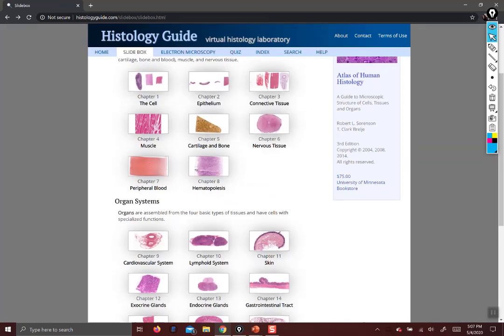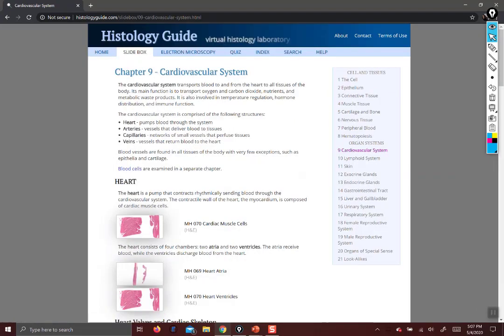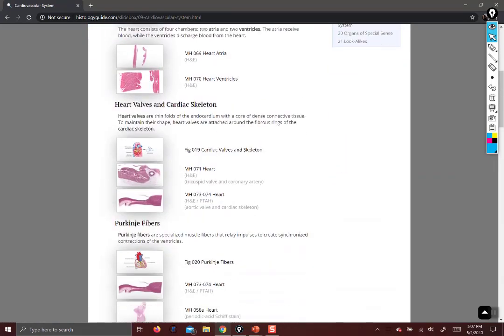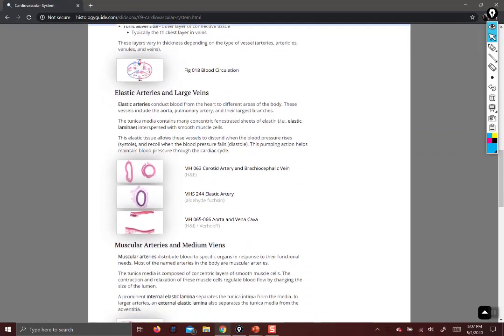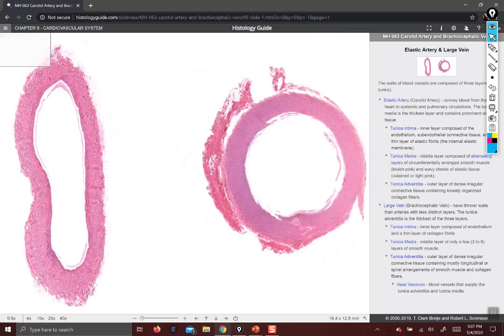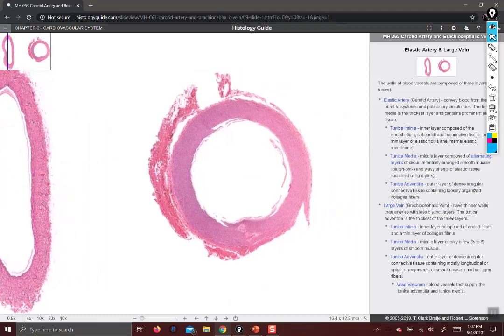Now we're going to go down to the circulatory system. I'm going to skip heart for now and just look at some vessels. Right off the bat I can tell which is which: the artery is going to have a thicker wall and a rounder lumen, and the vein is going to have thinner walls and a collapsed lumen. So the vein is on the left, the artery is on the right. I'm going to start by zooming in on the artery.